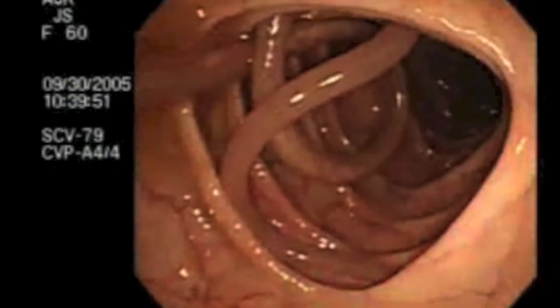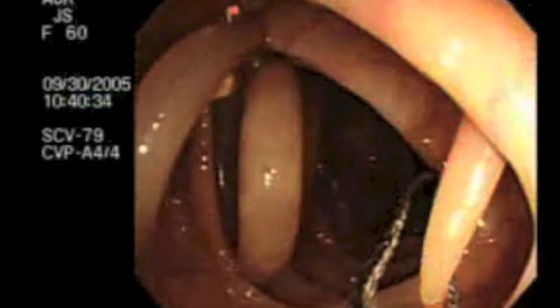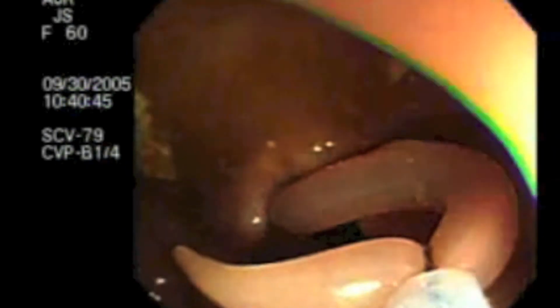In the middle of this kind of ball, we saw the Ascaris. What is the Ascaris? The Ascaris is a worm-like parasite that lives in different and extreme places such as our stomachs, producing in us several damages and discomforts in our body.